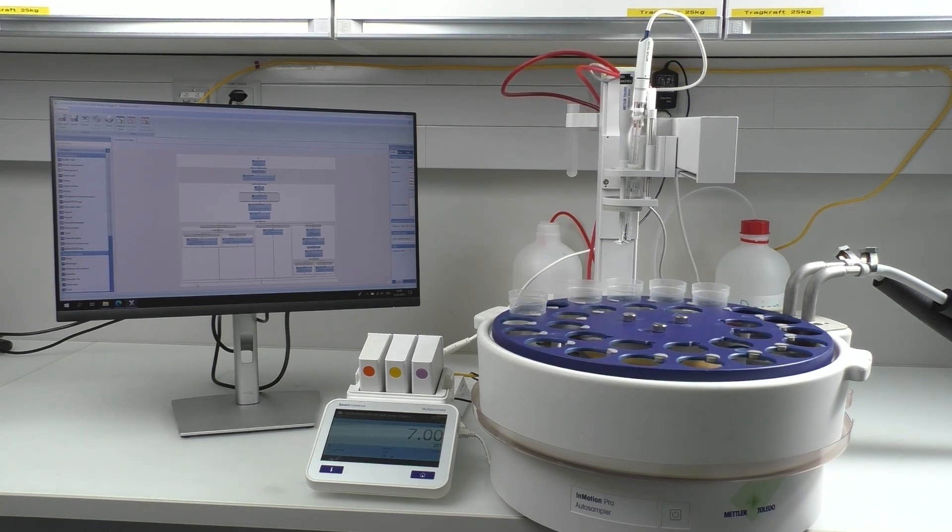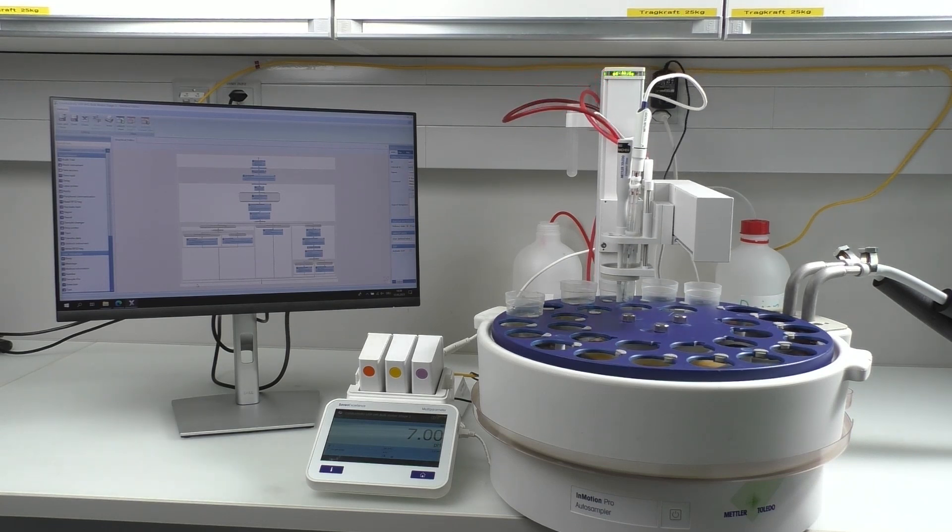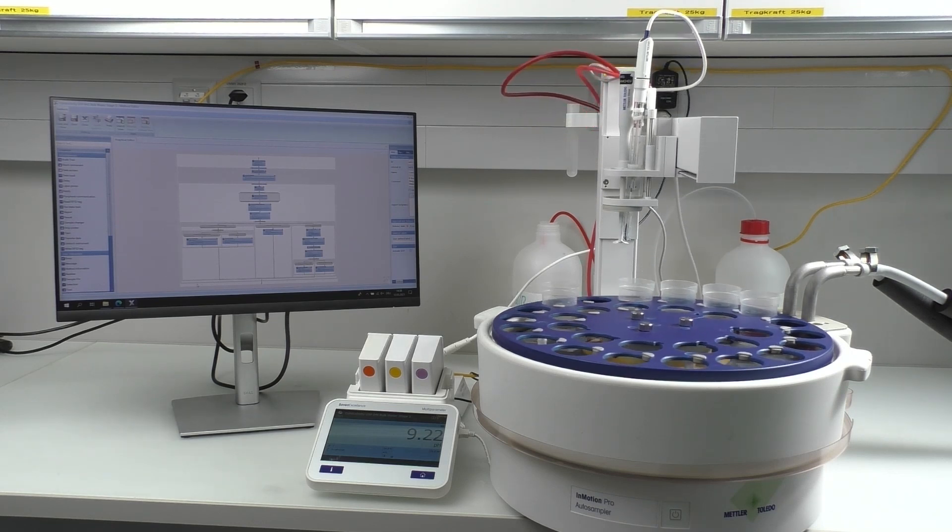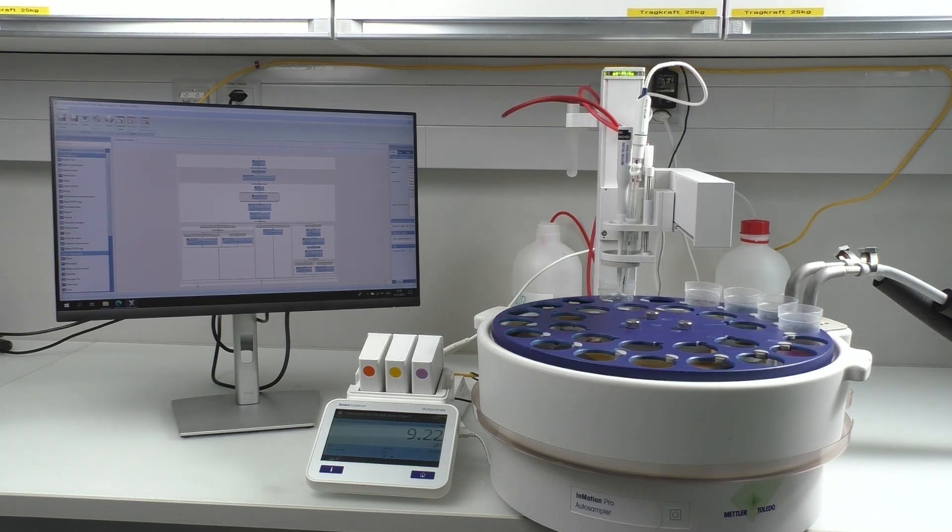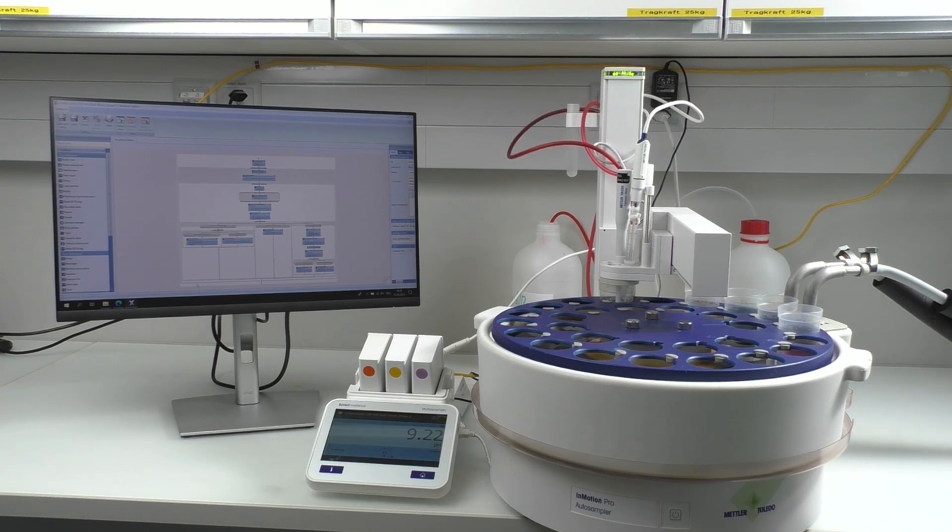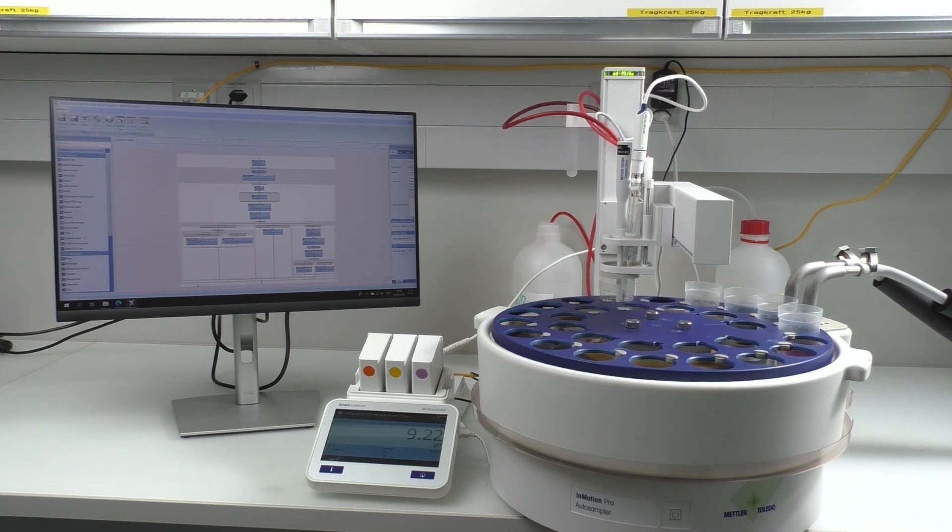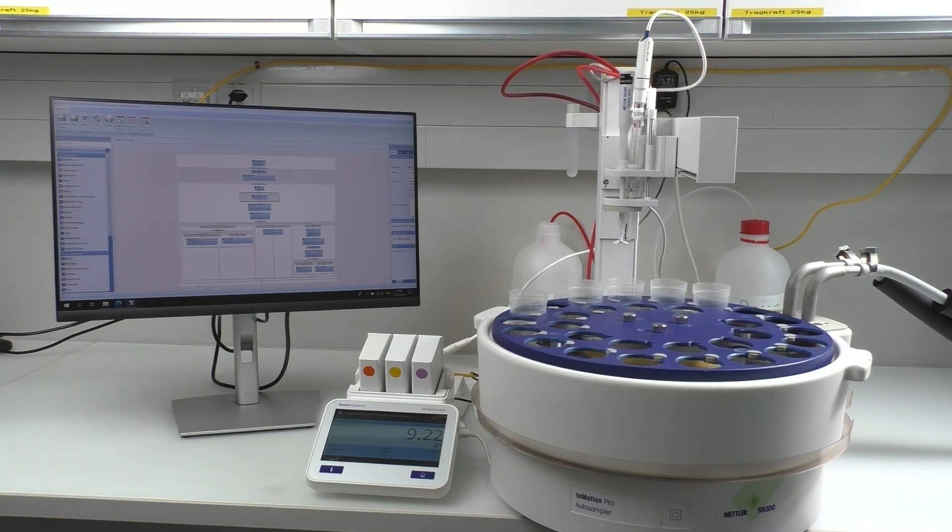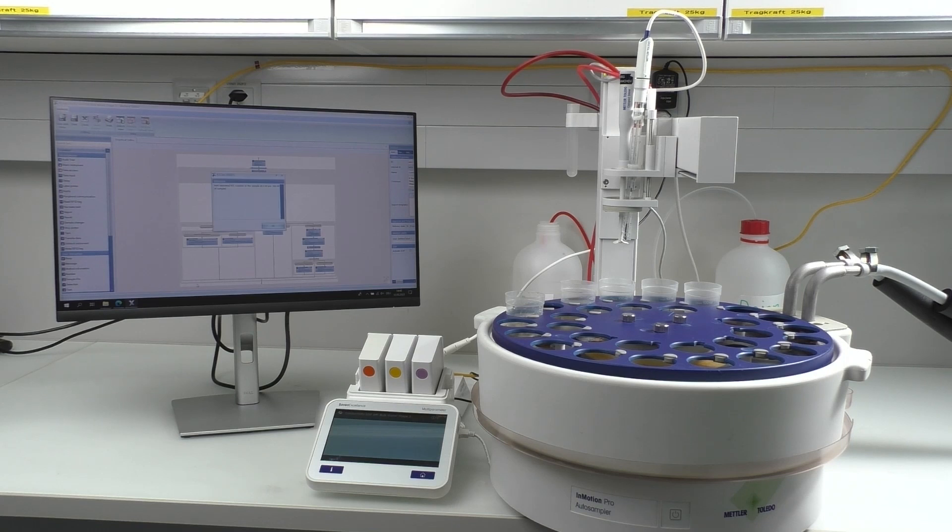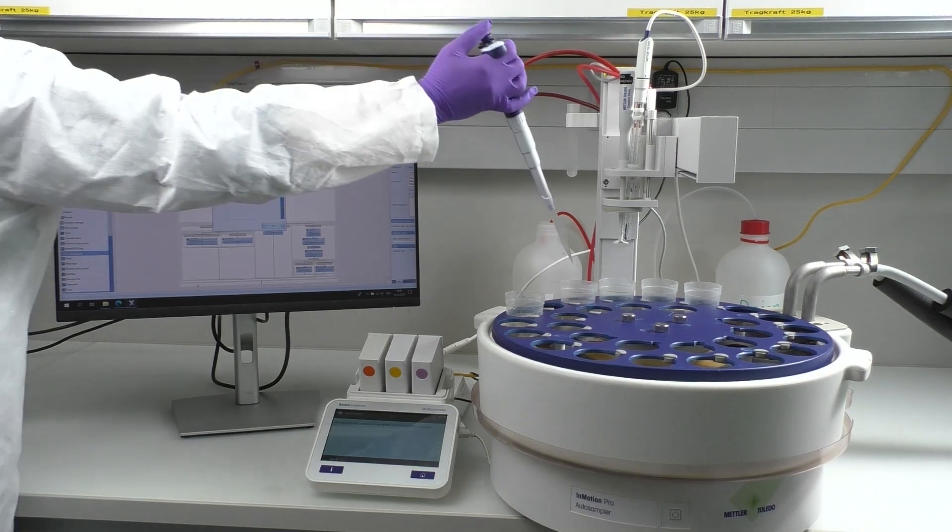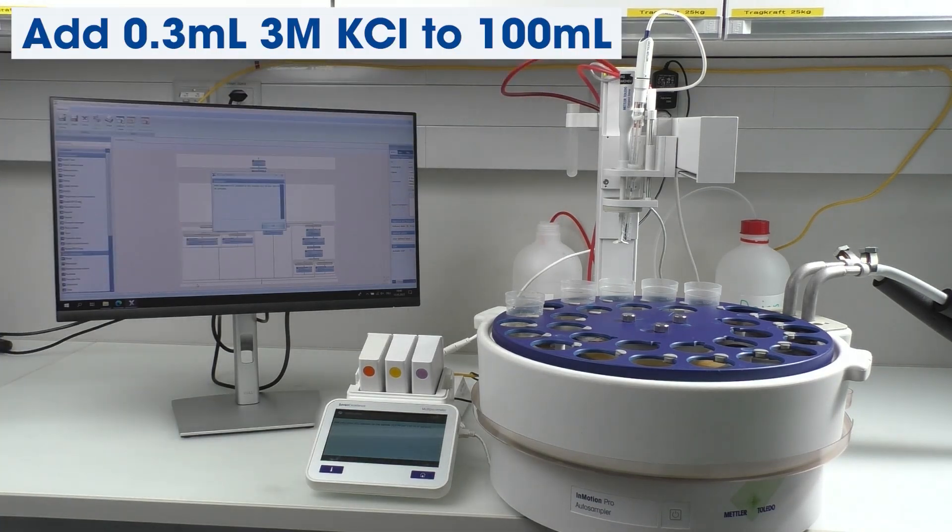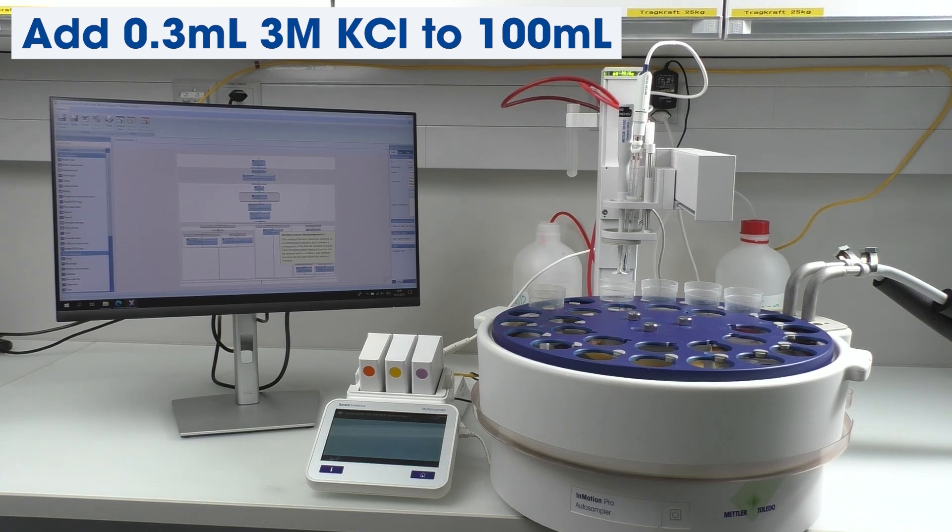In our case, the electrode has very good performance, so we can move to the measurement step. In order to adjust the ionic strength, 0.3 milliliters of 3 molar KCl is added to 100 milliliters of the previous sample. Now we can measure pH.